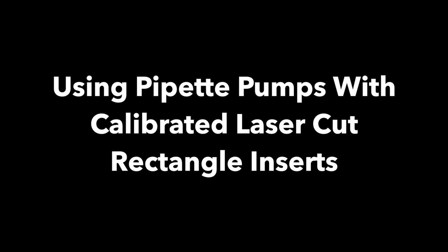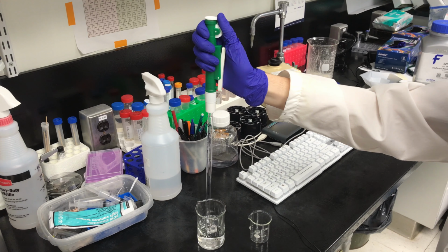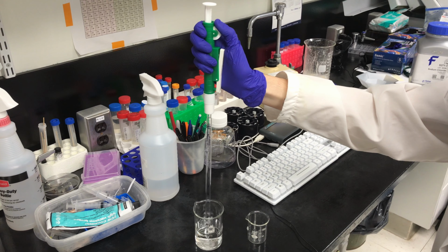Using pipette pumps with calibrated laser-cut rectangle inserts. A serological pipette is connected to a pipette pump at the pipette cone. Above that is a side lever, and above that is the thumb wheel. Caroline is filling up the serological pipette with water by putting the tip of the serological pipette in a beaker of water. She then uses her thumb to roll the thumb wheel.